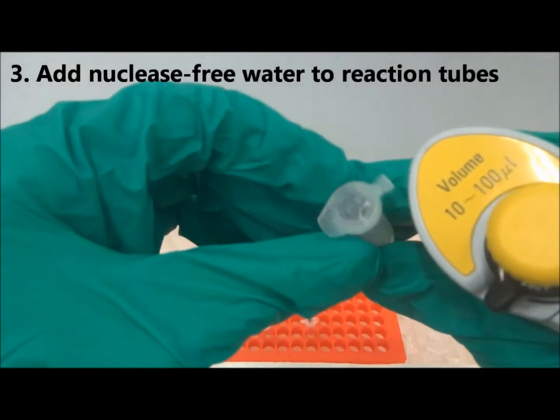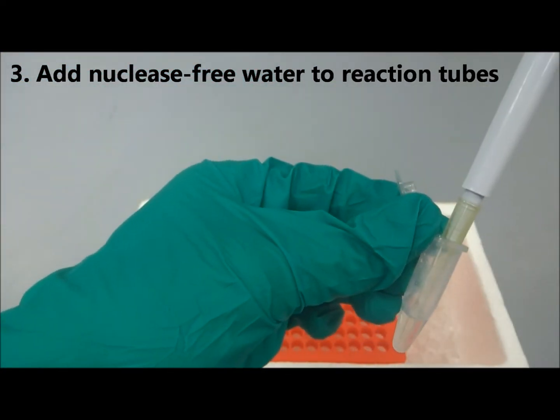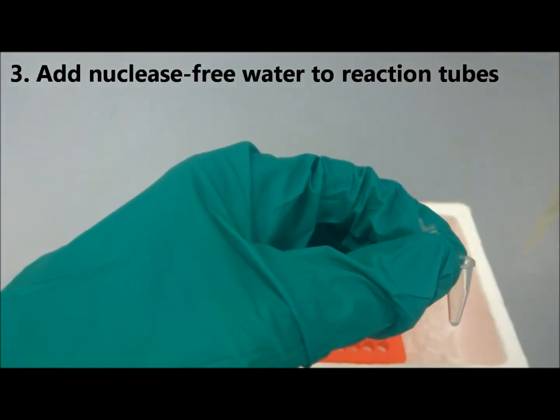Add the required amount of water into each reaction tube. You should add the component that is required in the largest amount first.